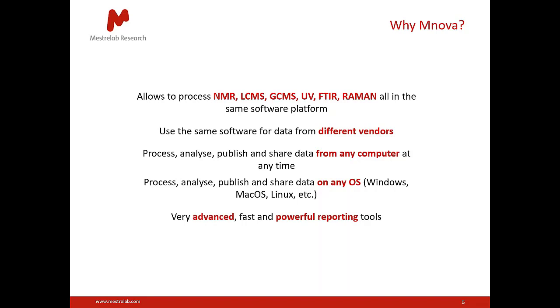And I would say it looks very simple when you first look at it, but it's very powerful. It has a lot of advanced and powerful tools built in that you just need to unlock as you get more comfortable. And like I said before, the MGears automation, that's where we're driving a lot of our efforts in the last year or so. And I just want to give you one example of that before I go on.